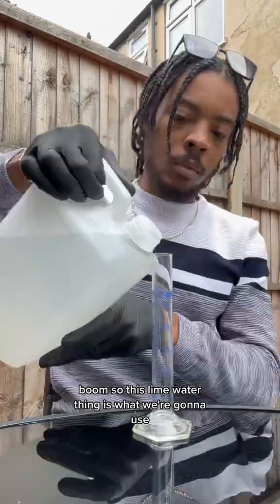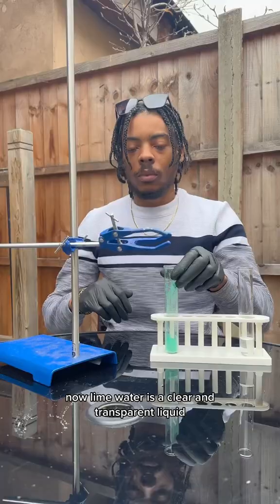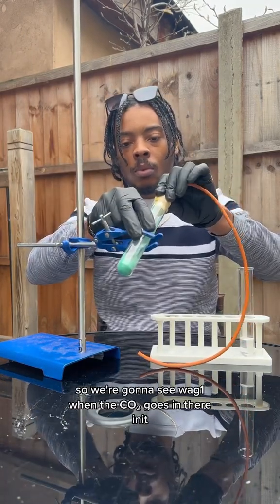This lime water is what we're going to use to test for the presence of carbon dioxide gas. Lime water is a clear and transparent liquid, however when it comes into contact with carbon dioxide it turns to a white milky color. So we're going to see that when the CO2 goes in there.